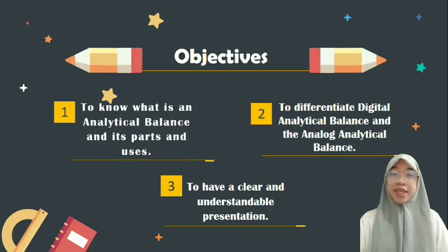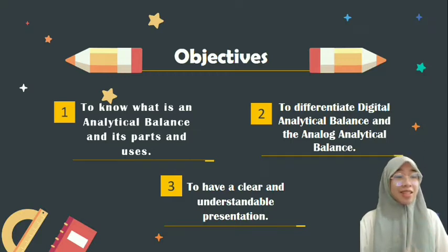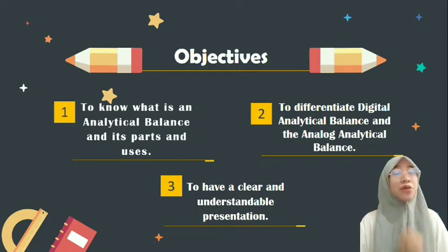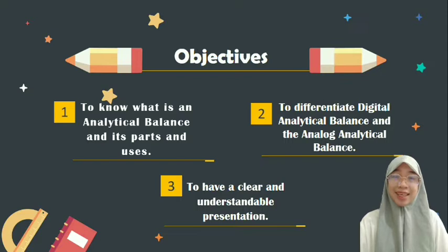Before we proceed in our formal discussion, let me state first my objectives for today's presentation. These are to know what an analytical balance is and its parts and uses. Second, to differentiate the digital analytical balance and the analog analytical balance. And the third one, of course, is to have a clear and understandable presentation.